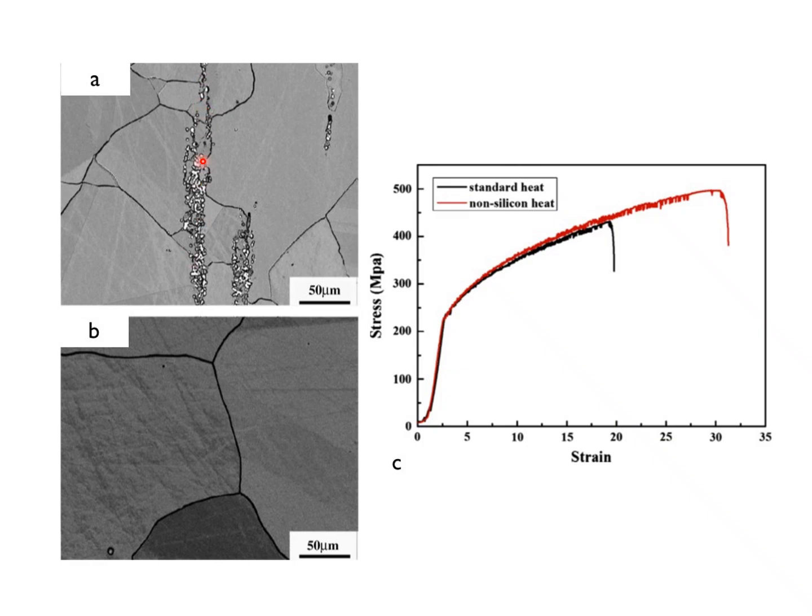So this is just bunches of precipitates that are segregated in certain regions. And when you have an impure material like this, you get that same lowering of the ductility, which can be very definitely associated with these inhomogeneities in the material. And if you don't have them, you get much better response and it's more ductile.